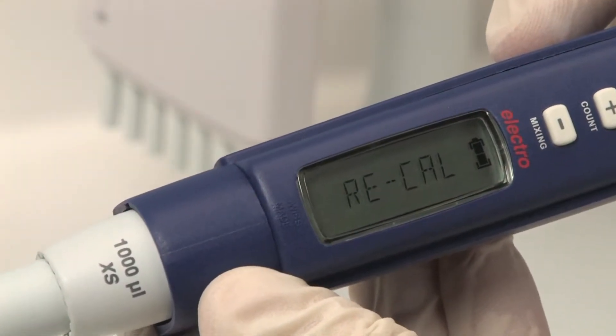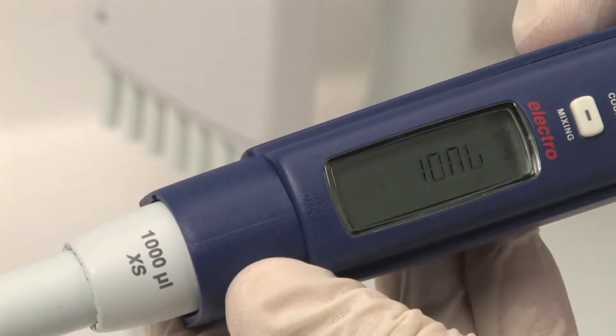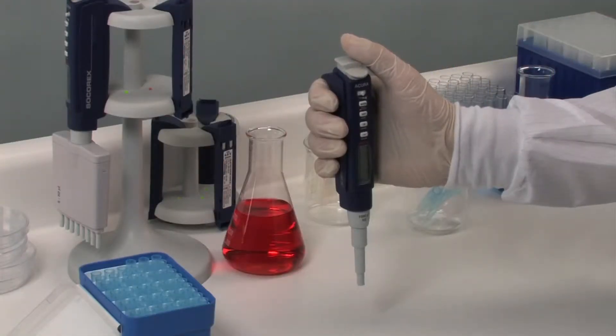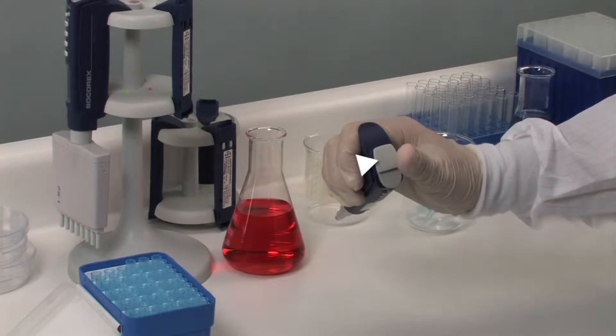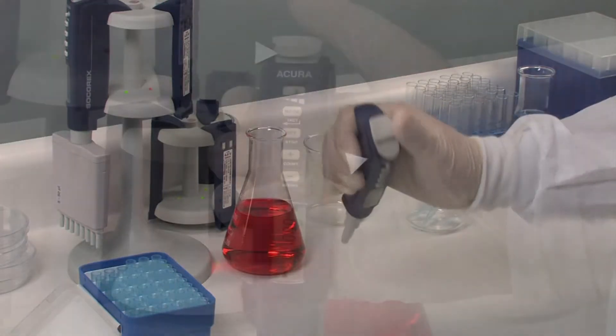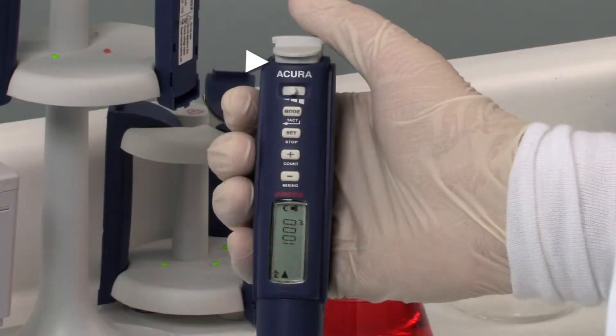Immediately after inserting the battery, the instrument will perform a quick function check. There are a few buttons to activate for use of the instrument: a large back-position tip ejector button, a start button, a speed selector with three positions, a menu key for accessing pipetting modes and other program loops, a set key to confirm a selection or as an emergency stop, and selection keys to change parameters such as volume or number of doses.